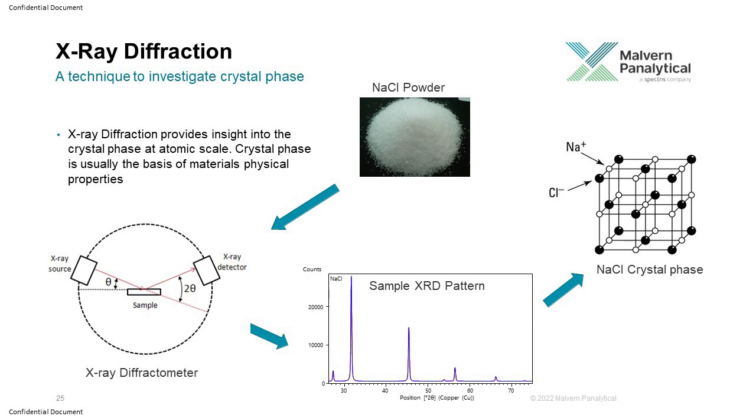So it is a fingerprint of the compound, not of the elements. Whatever compound is present, XRD tells you about the compound. This XRD pattern is related to the crystal structure, how the atoms are arranged in the crystal, which is a fingerprint of your sample.